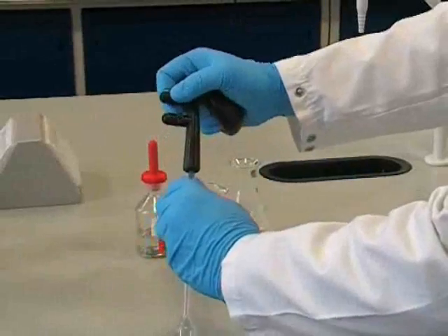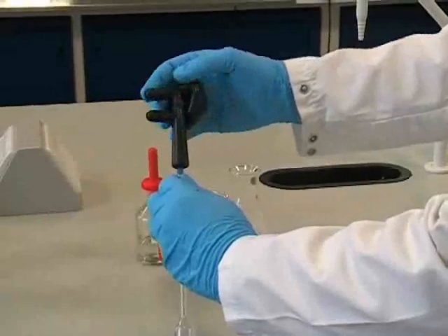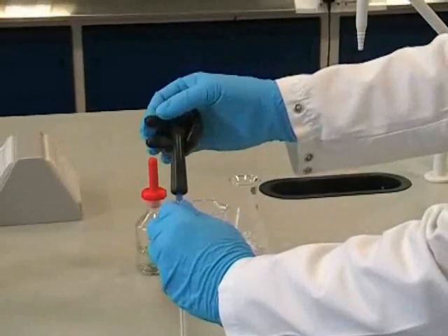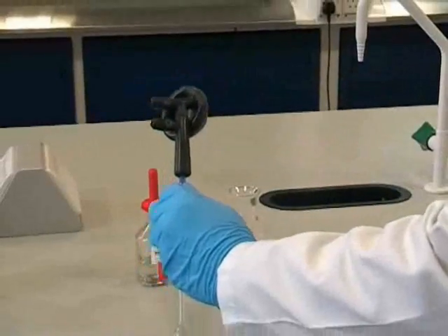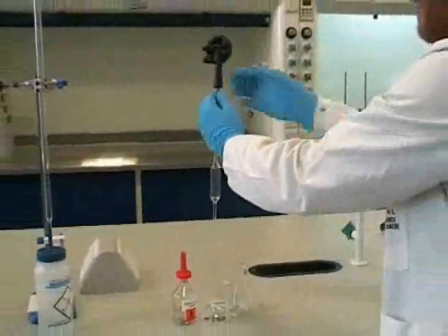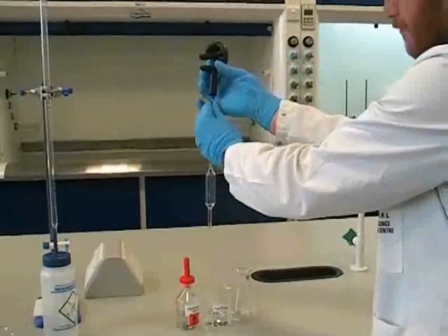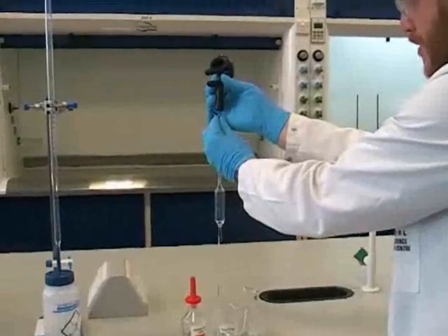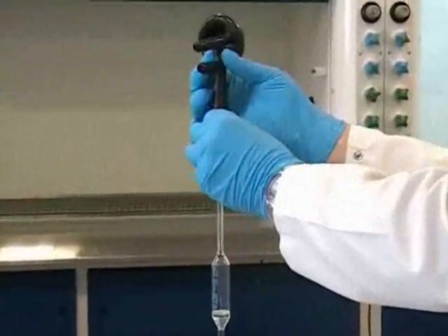Now we can press the appropriate button on the pipette filler and gently squeeze the bulb to expel the air. We're now able to draw up some of our solution into the pipette. We place the pipette into the solution and press the appropriate button on the filler, and this draws the solution into the pipette.